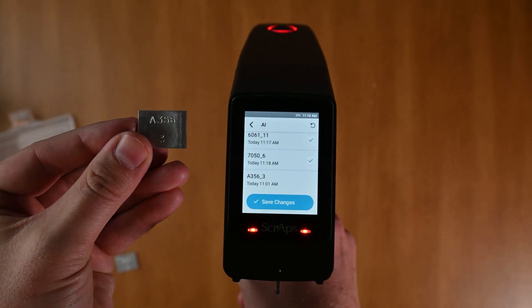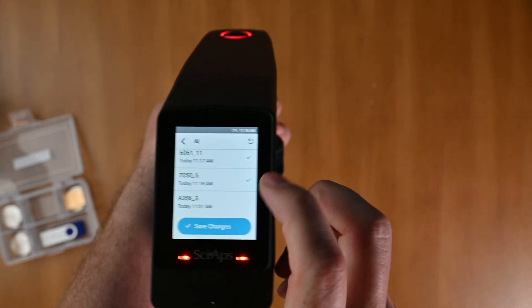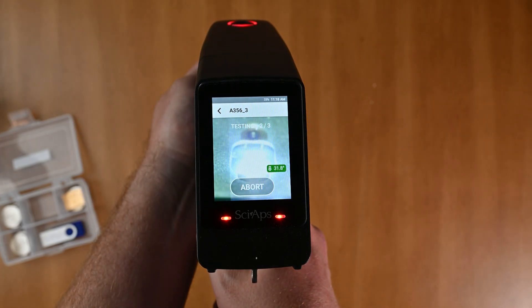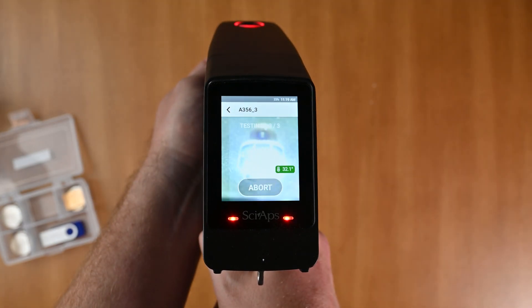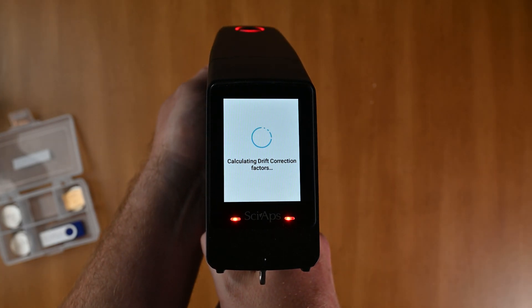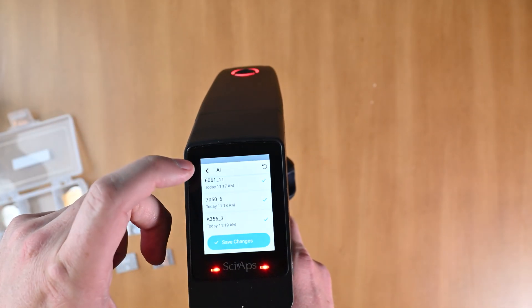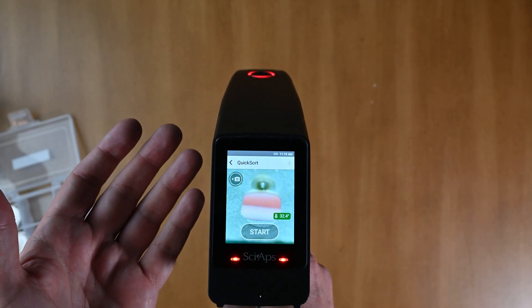We're going to grab the A356 sample and put it in front of the analyzer. I'll select it and hit go. This is the last one of the aluminum family I'll need to do, but this is going to let me get much closer on my results. It's a little bit tedious, a little something extra you've got to do, but it is going to help you get better results at the end of the day. I'll hit save changes, go back, and now I'm back at my results screen and ready to shoot.